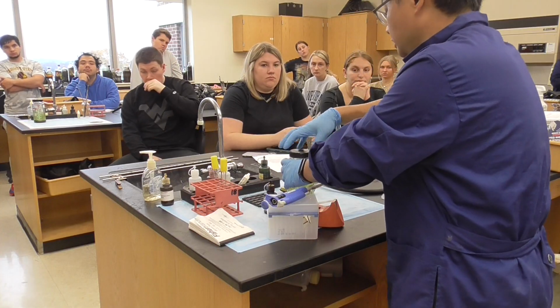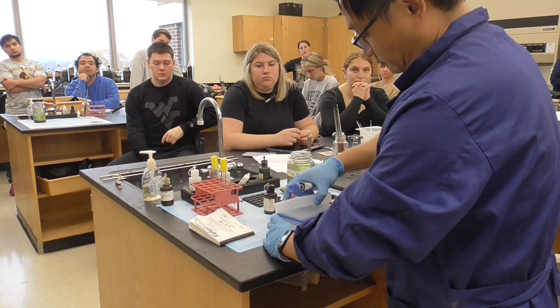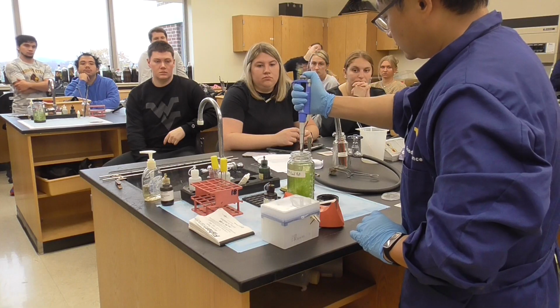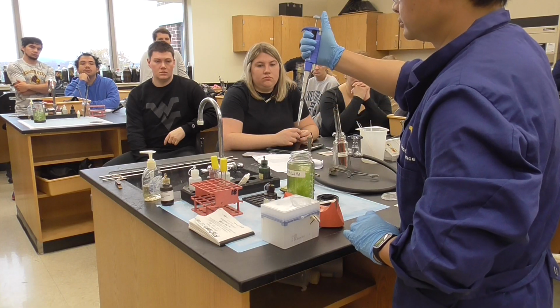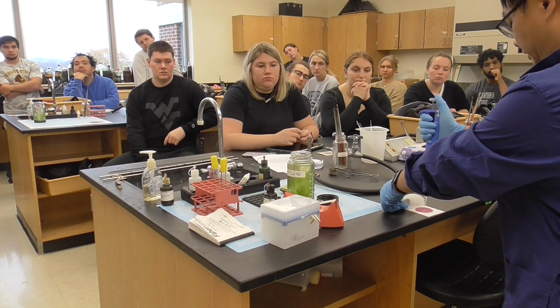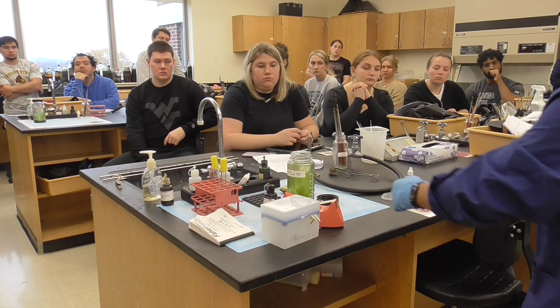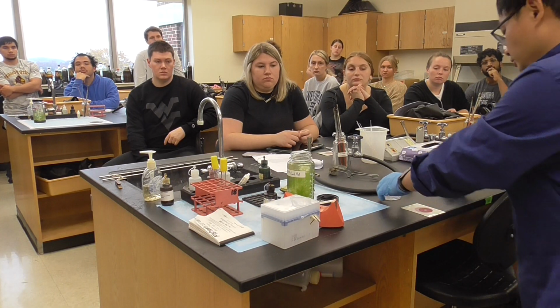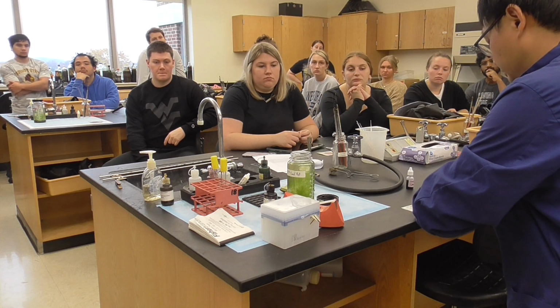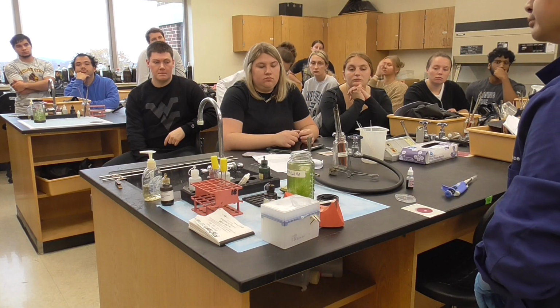Let's say you finish the dilution. I just do a demo. You finish the dilution. How do you do it? You need to add 1 ml. Okay, now put it right in the middle of the circle and let it spread. And I will usually use this presser to gently press a little bit. That's good. Eventually it will be all covered.